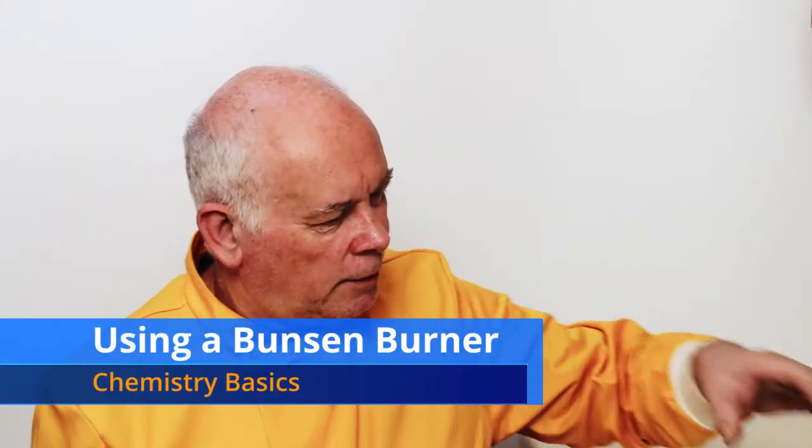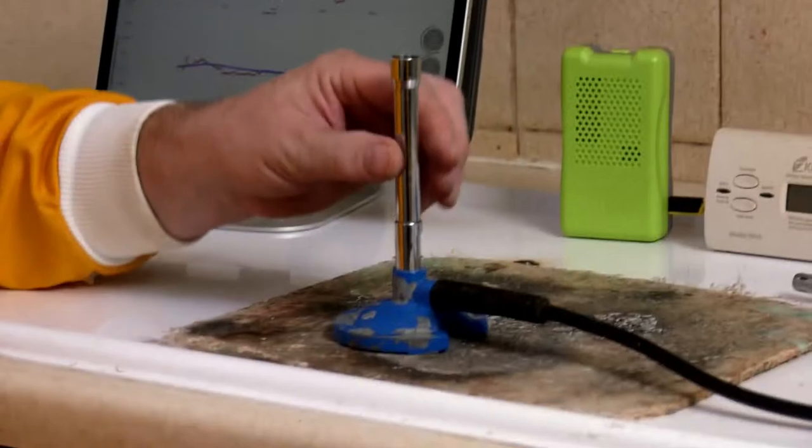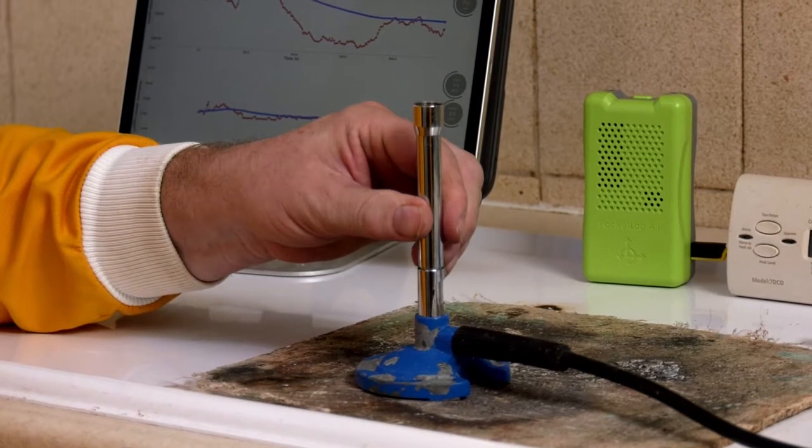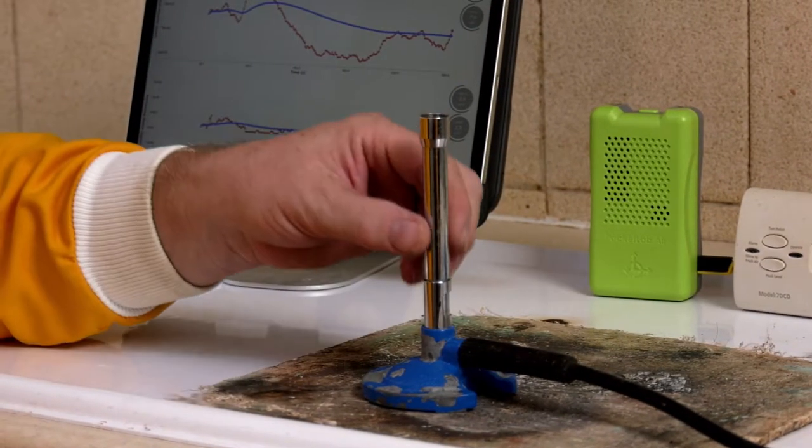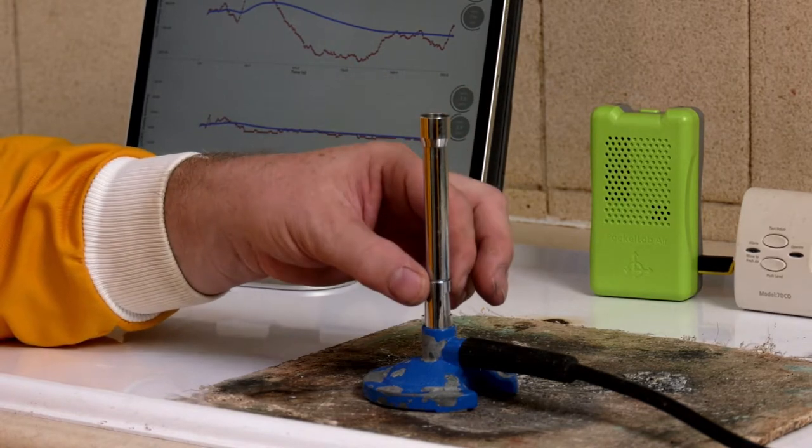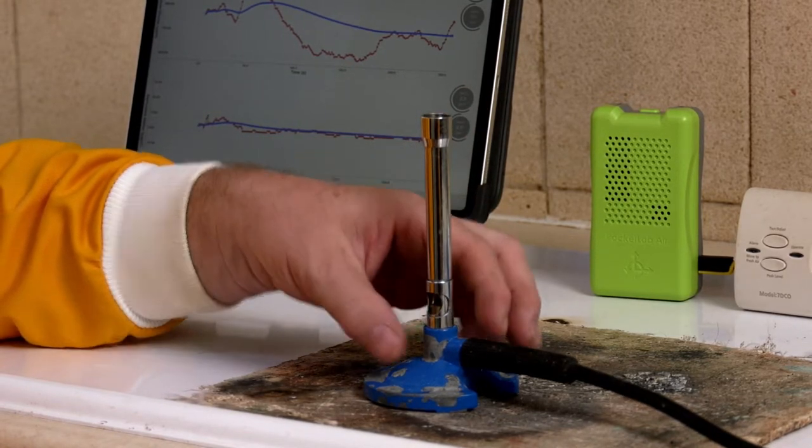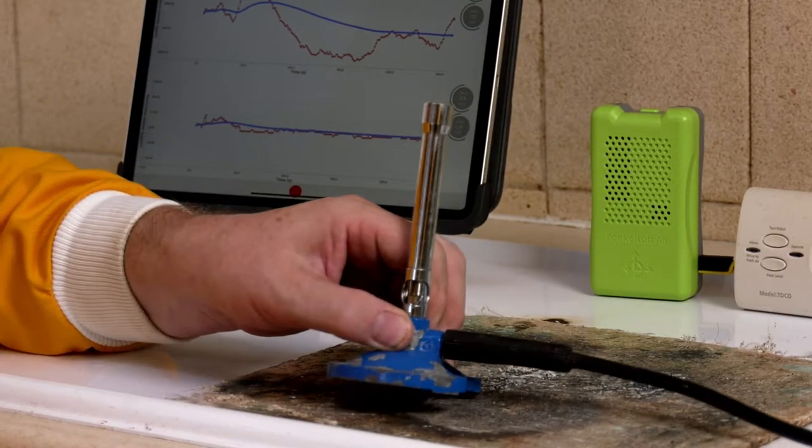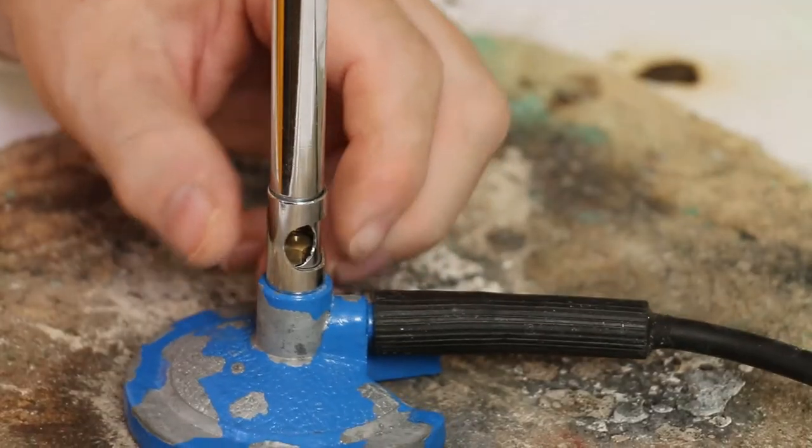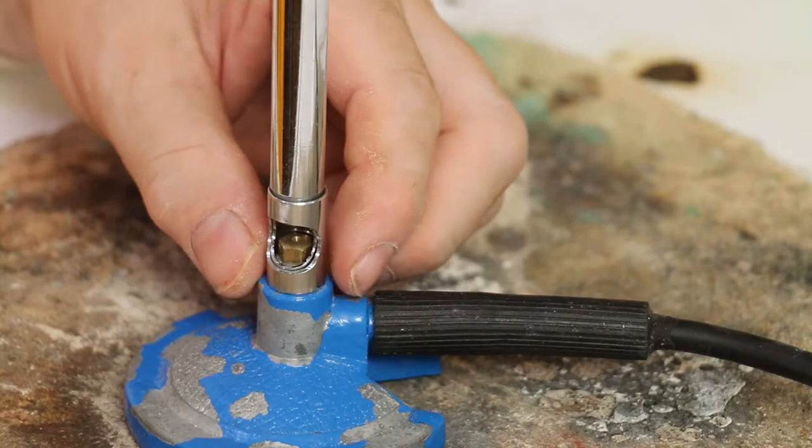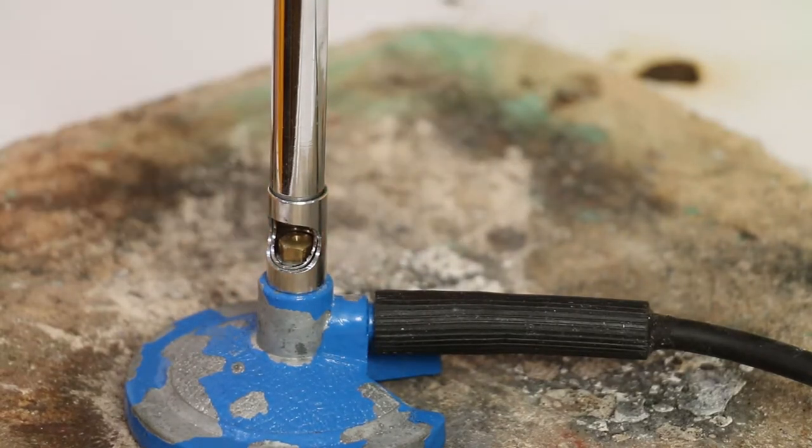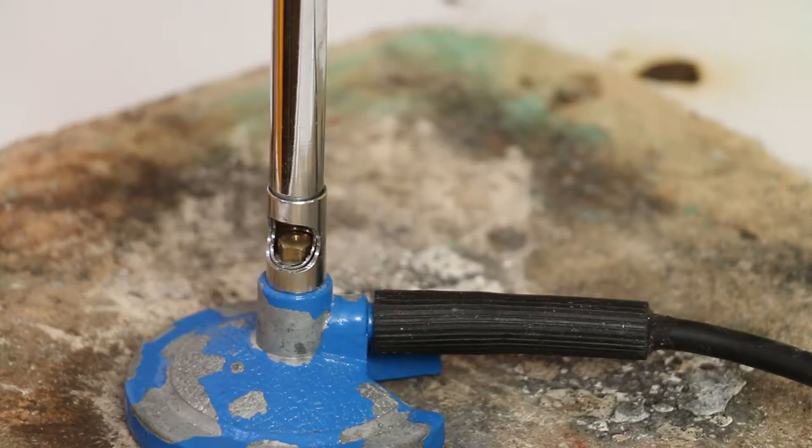This is all about Bunsen burner. This is a Bunsen burner many years old, developed by a guy called Bunsen surprisingly, and simply a gas supply going into a tube with a collar. Now at the bottom we can see there is a very small hole and the gas goes through this small hole.